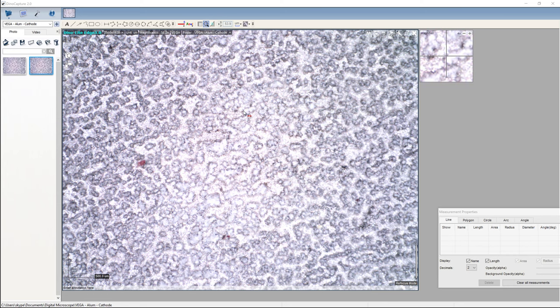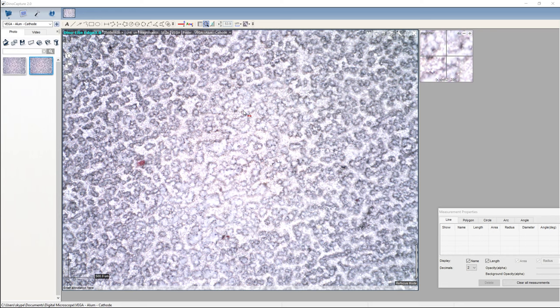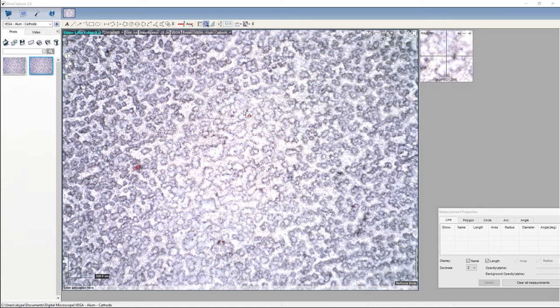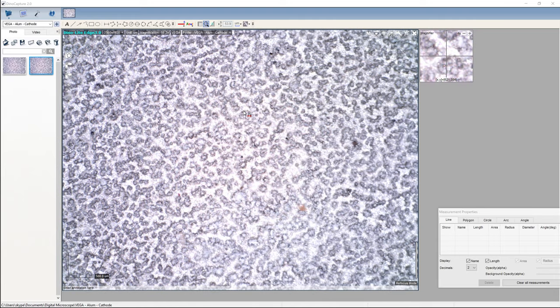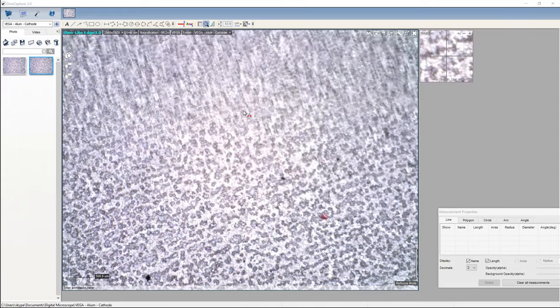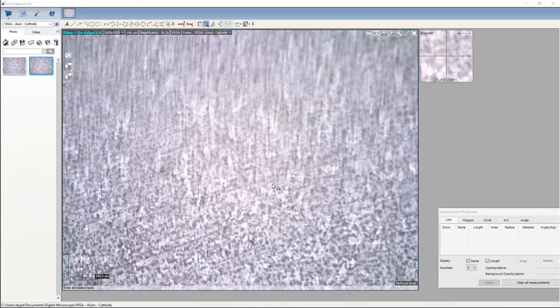And the interesting thing is, if we move from the central area that was, I guess, opposite the anode, and we move down this way, you can see the nature of them changes. They kind of get smaller and smaller and smaller. It would almost appear like they're going with maybe the grain of the brushed aluminium or the abrasion that Henk Jurrien used to maybe clean it off.